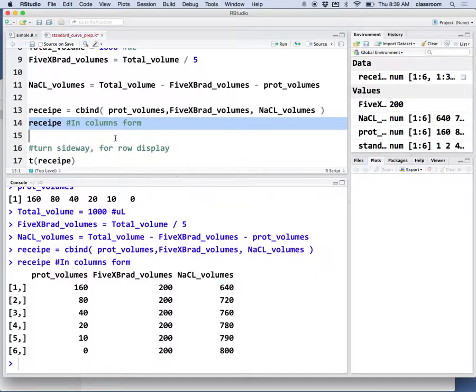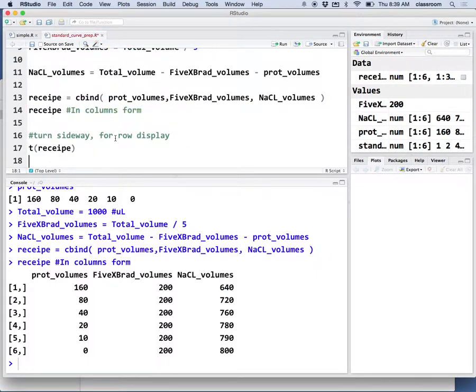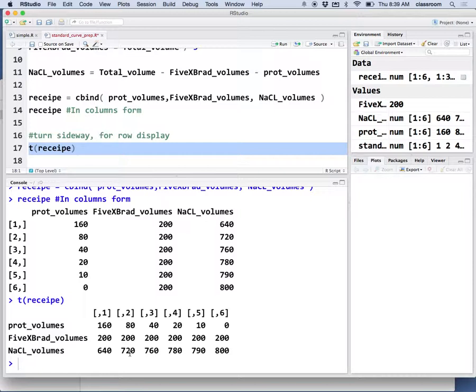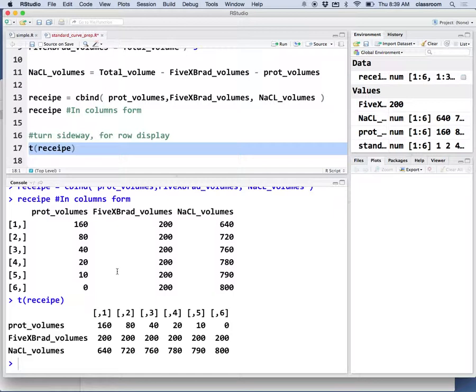For your lab report, you may want to do the table the other way. The T command transposes it: protein volume, 5x Bradford volume, and sodium chloride volume. This is just a small example to show how this can be done in R.